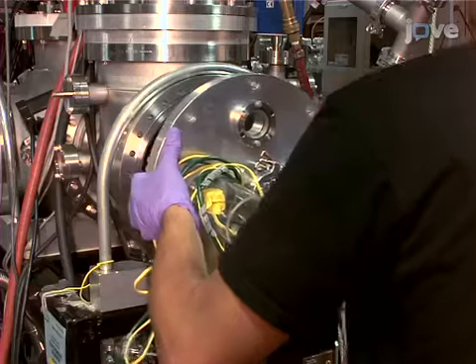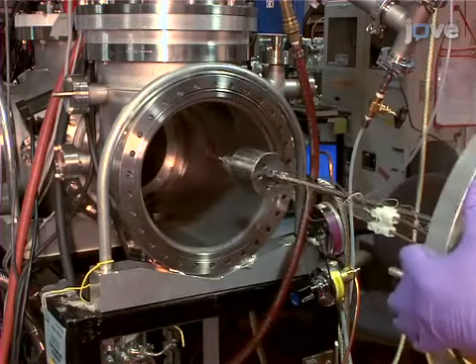We hit upon this idea a few years ago since we wanted to get DNA molecules into the gas phase and measure the ionization energies. This method provides unprecedented access to electronic structures of molecules and clusters, particularly when one does photoionization of DNA bases.